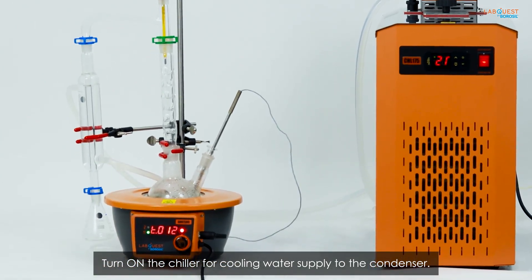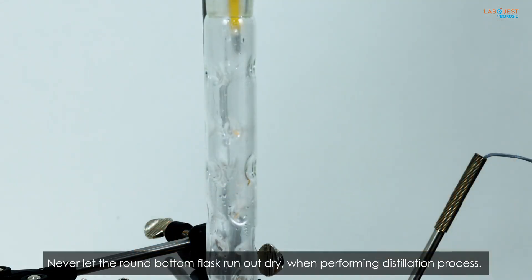Never let the round bottom flask run out dry when performing distillation process.